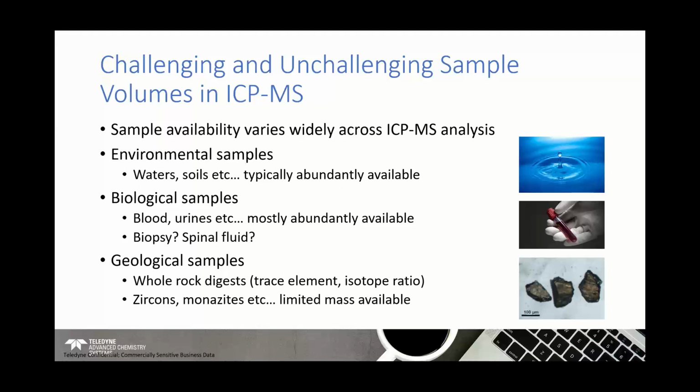If you think of a blood sample for a moment, if you've just taken a blood sample from somebody in a volunteer suite or a hospital clinical environment, you may well have, in a single vacutainer from the vacutainer sampling system, 8 to 10 milliliters of blood to work with.